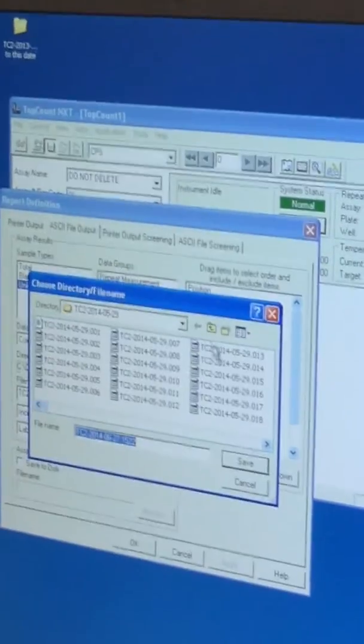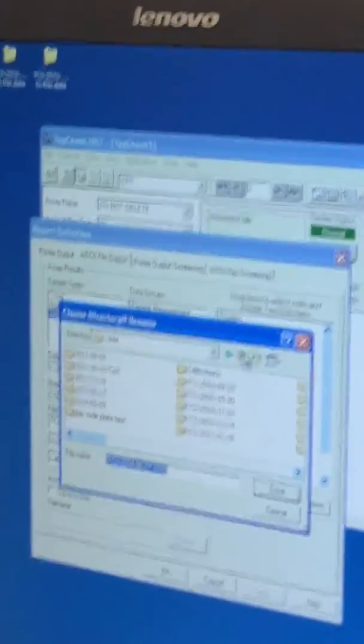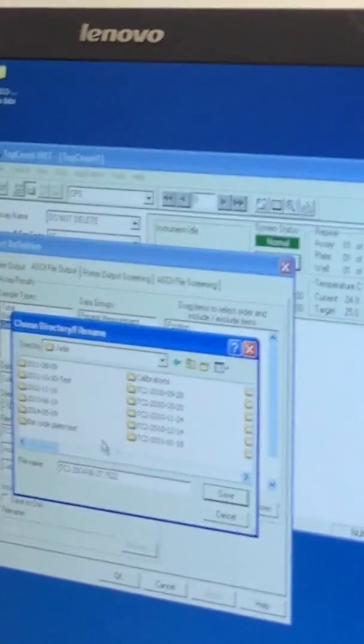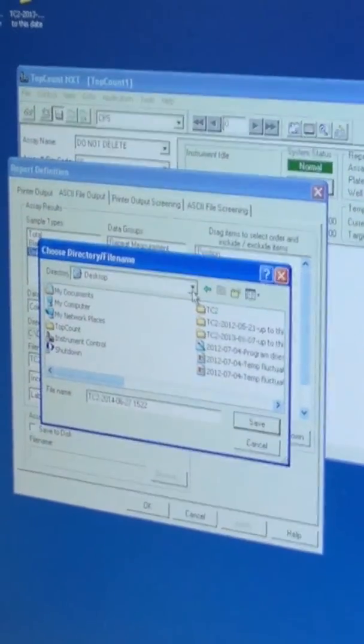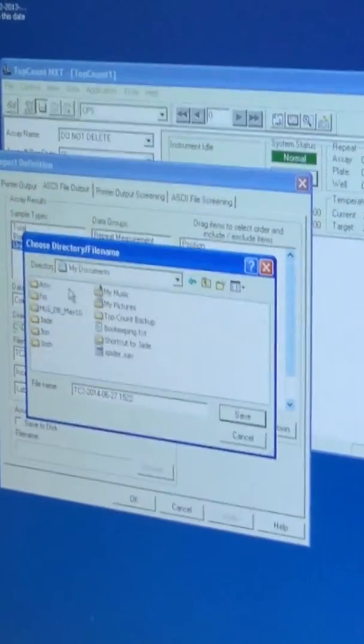Right now, we've been saving things in my folder. I don't know if we created one for you yet. We don't have to. Let's keep them in mind for now. Okay? So, what I've done is on the desktop, I've created a shortcut for my files, which are really in my documents.